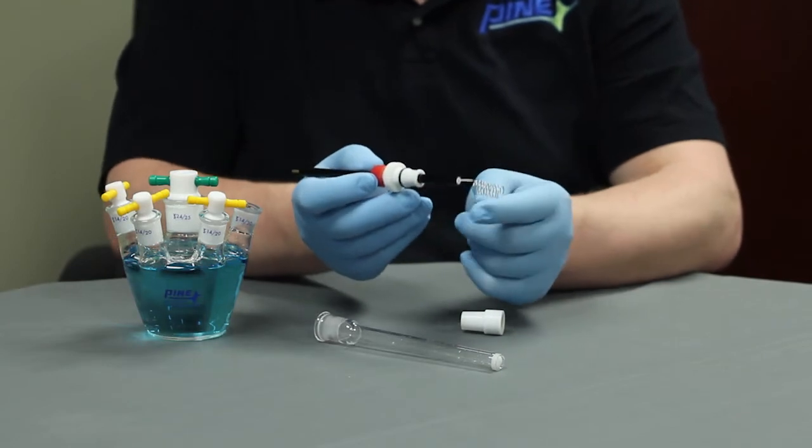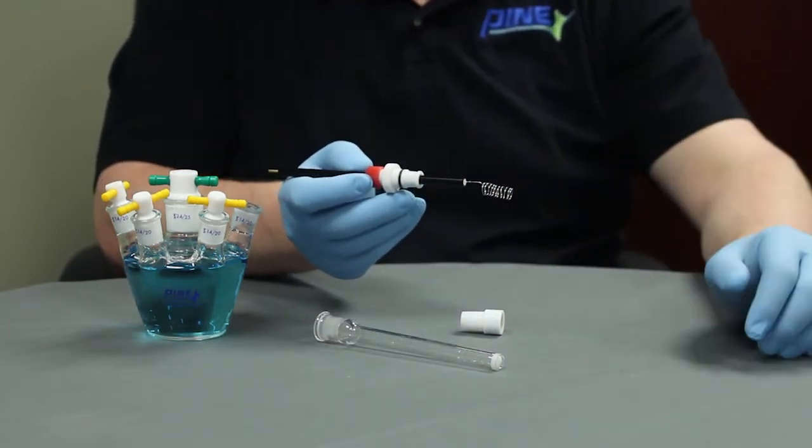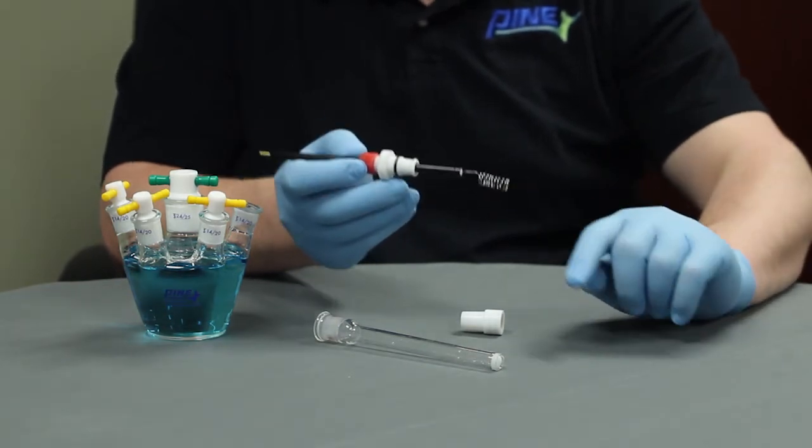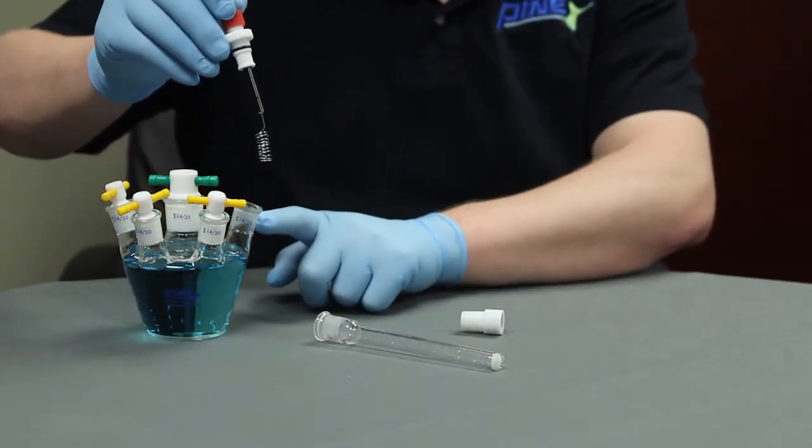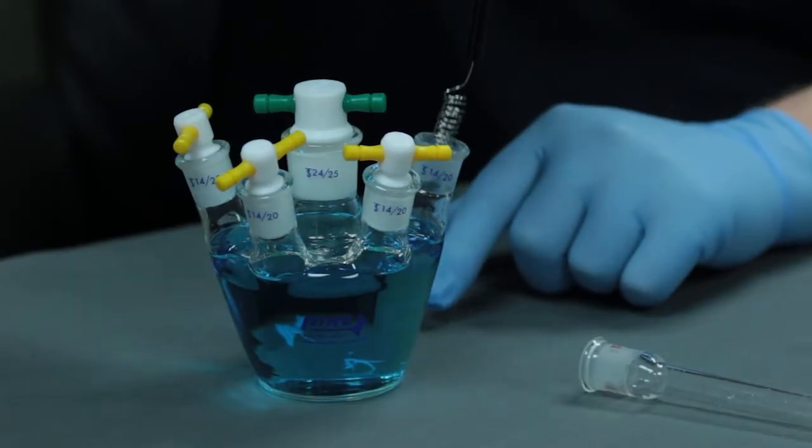And now you can use the platinum counter electrode with the coils in direct contact with solution. Simply place the platinum coils through the 1420 port of a cell, being careful not to damage the platinum coils.